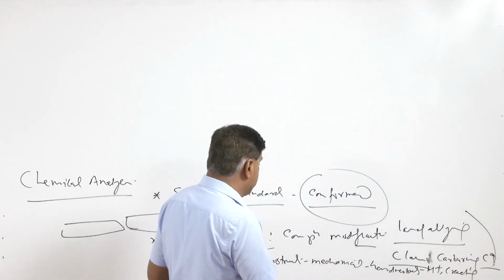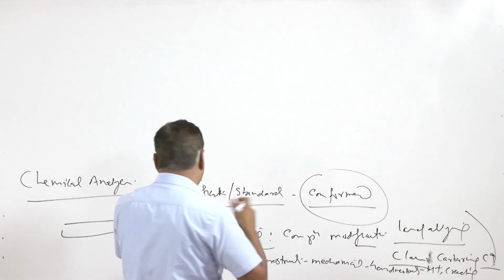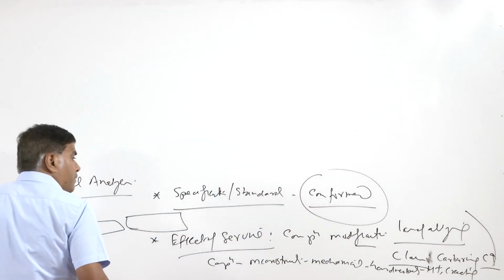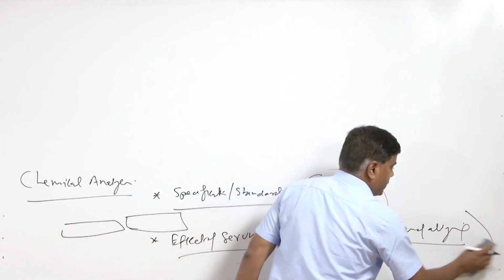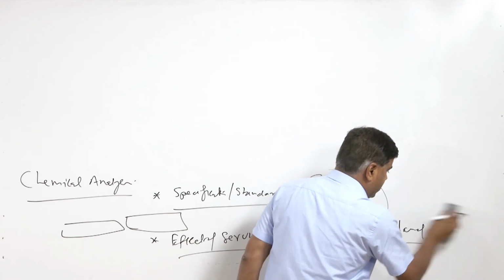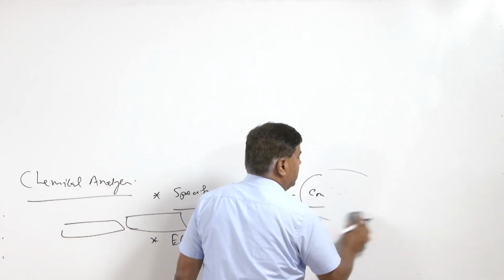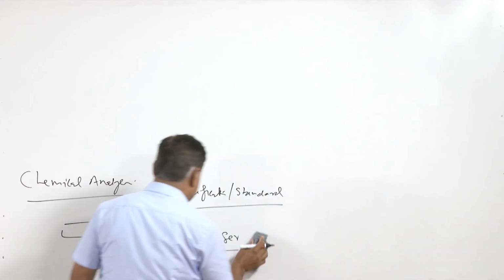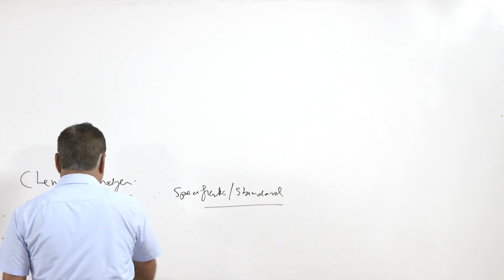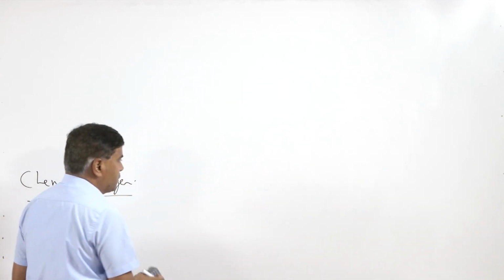So it becomes important to really see if the composition was as per the requirement or if it has been different from what was specified or what was expected to be there in the component. Sometimes loss of alloying elements or enrichment of the alloying elements in the component during service can also lead to modification in properties, which we can see with regard to two aspects.